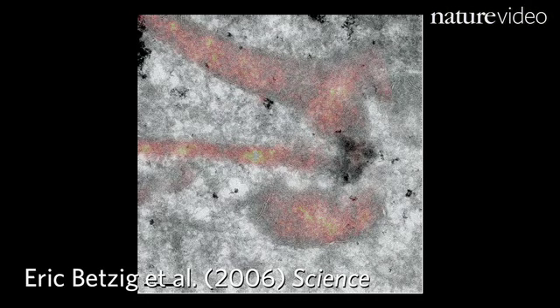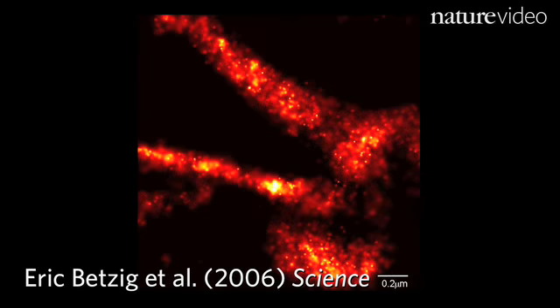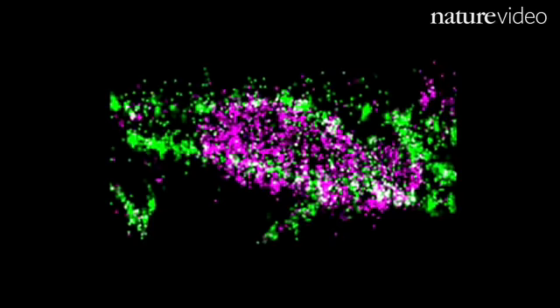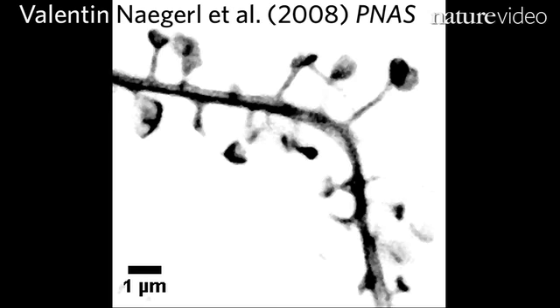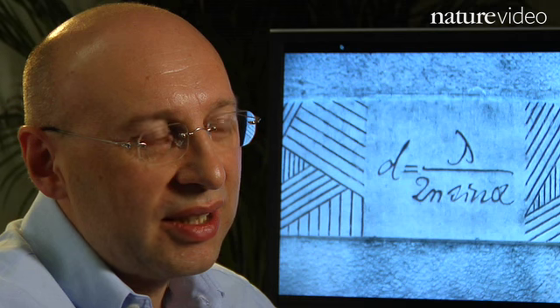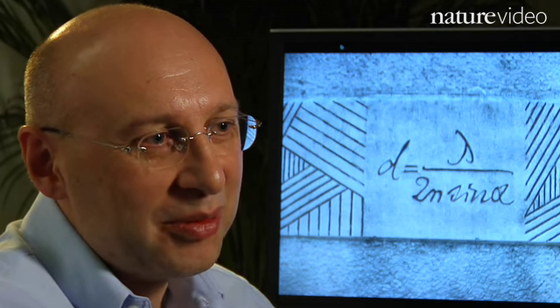For the first time, you just saw this absolutely spectacular distribution of tens of thousands of molecules inside the mitochondria. And when I saw that, I was ready to sort of fall on the floor. You can see now details, for example, structures in the mitochondrion, or structure in the nucleus, or say, even, for example, a neuron to see what it's doing when it's learning. I think there's a whole world down there to be discovered with focused visible light.